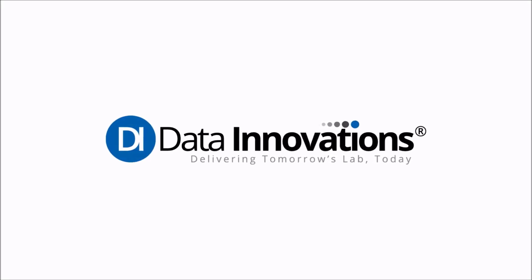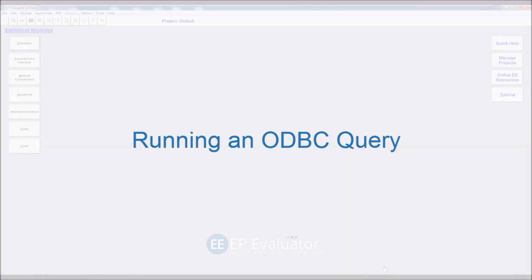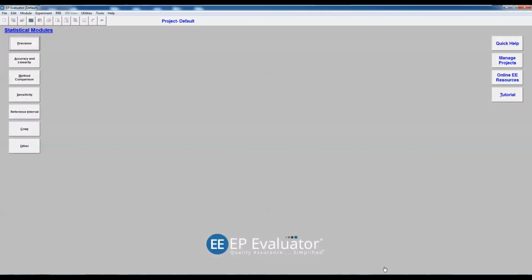Hello and welcome to this video on how to perform an ODBC query using EP Evaluator and Instrument Manager. This video assumes that you have been licensed for ODBC connectivity with an Instrument Manager and that setup is complete, and that you have a version of EP Evaluator that allows for ODBC connectivity, and again, the setup has been completed. If that is not the case and you still need to do the setup, there is a separate video that walks you through the steps to perform that setup.